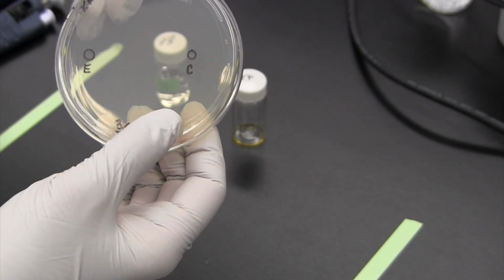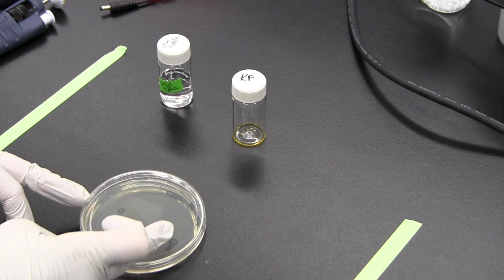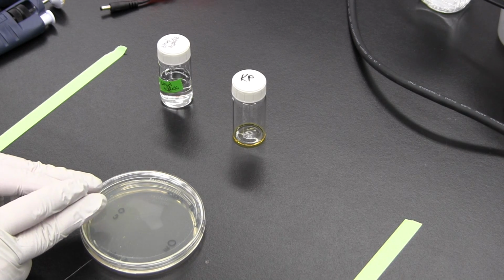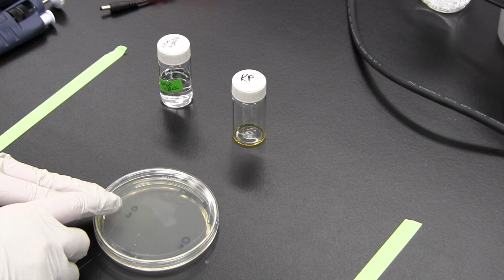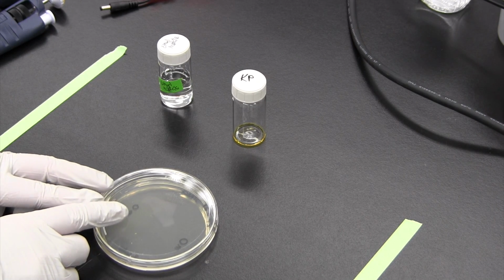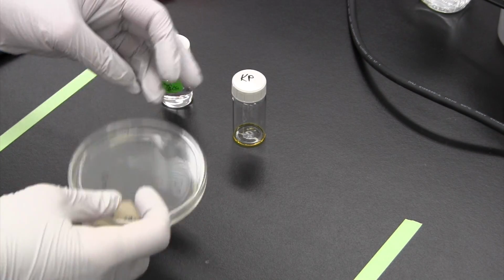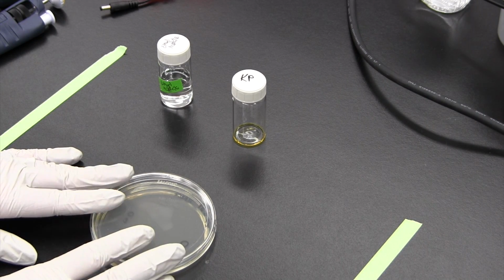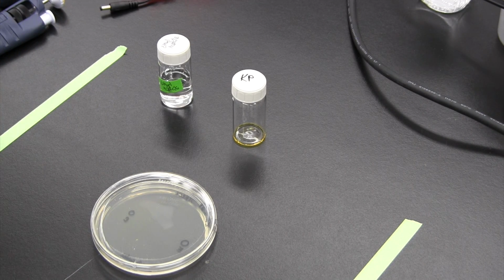All you're going to do at this point is use 10 microliters at a time. You're going to dot your extract onto your extract circle, your control onto your control circle, and let that evaporate off. You'll repeat that 3 times so that you have a total of 30 microliters of extract versus 30 microliters of your control dried on your plate. The next stage is making an agar overlay with a tester of choice. As you can see, I have B. subtilis on this plate, so we're going to use B. subtilis as our tester. That's then going to incubate, and then we will be able to look at the inhibition of growth of the tester strain to see if our chemical extract shows activity.